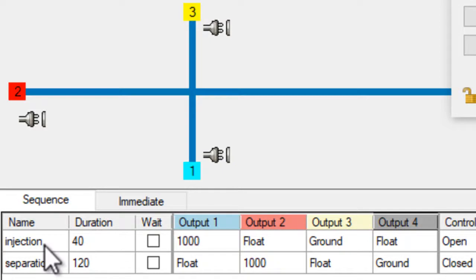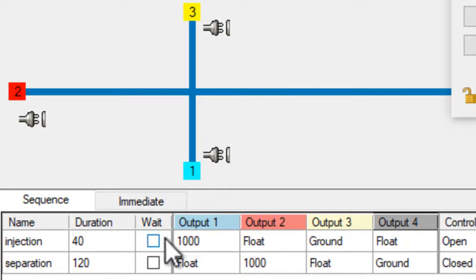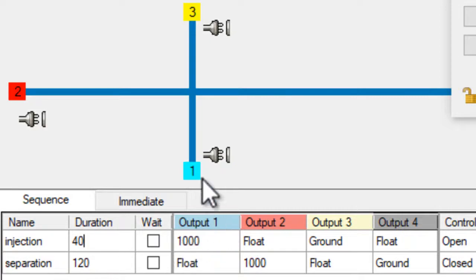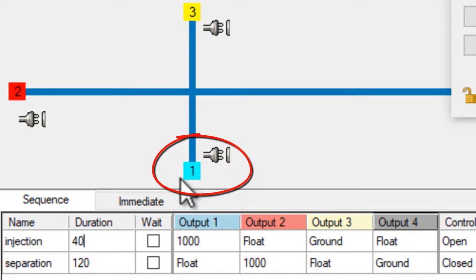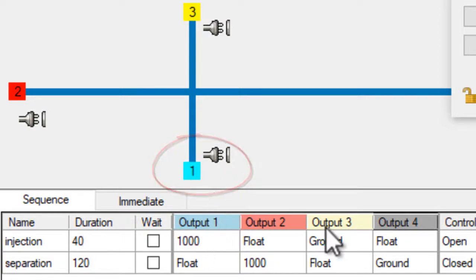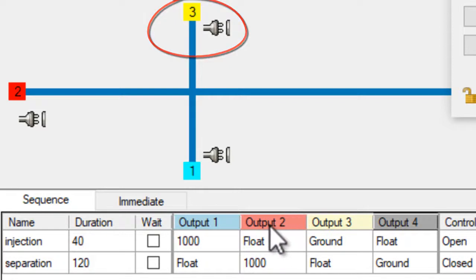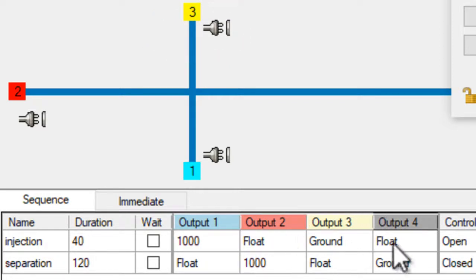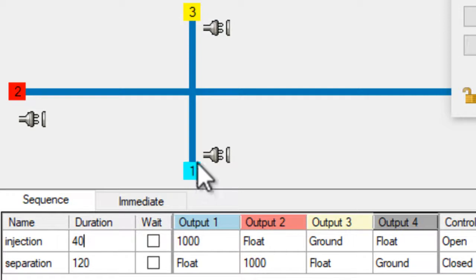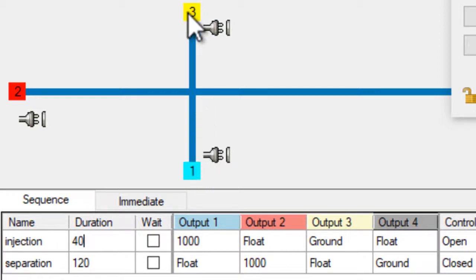In this sequence we have an injection which now lasts 40 seconds. It's going to apply a thousand volts to output one. This is where our sample is going to be. It applies ground to output three here, while output two and four are floating. So if our sample is here, it applies a thousand volts and pushes it to reservoir three.